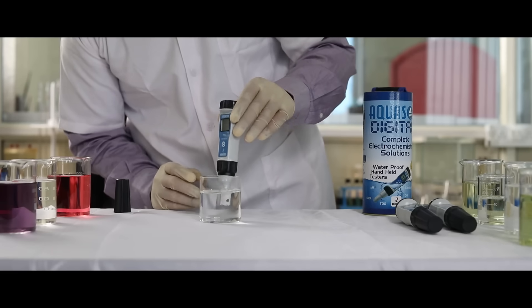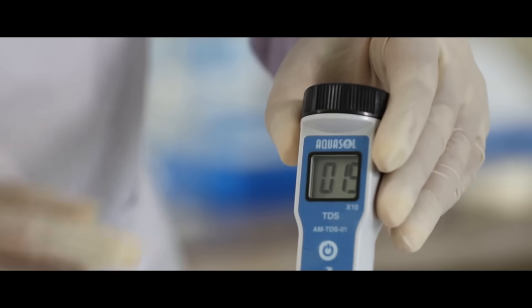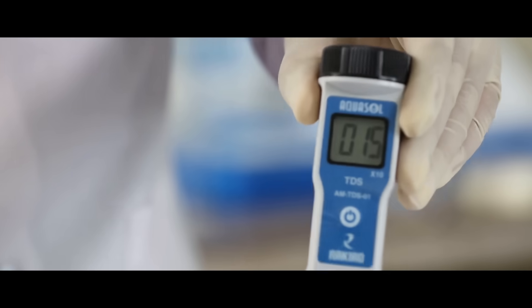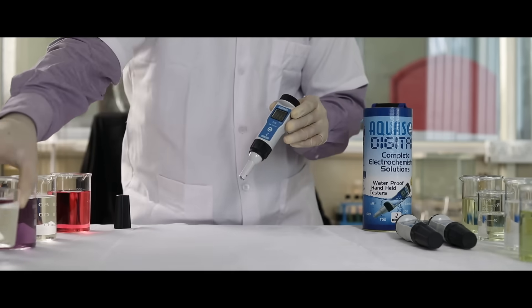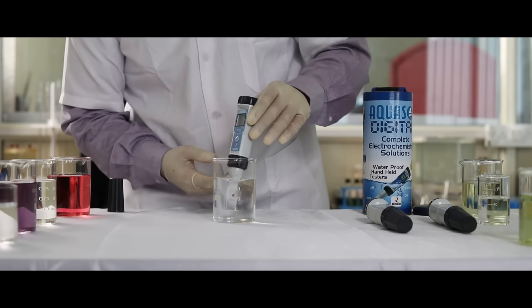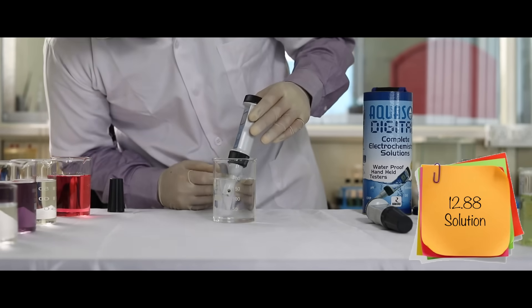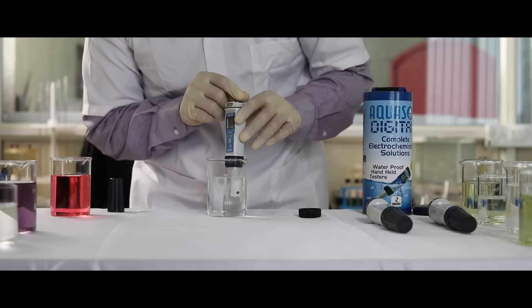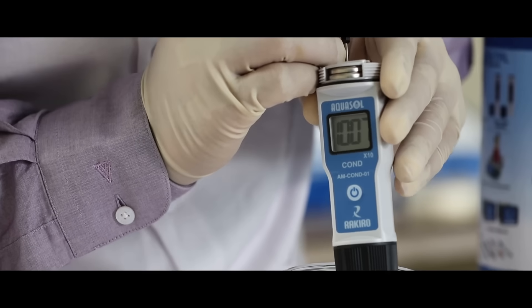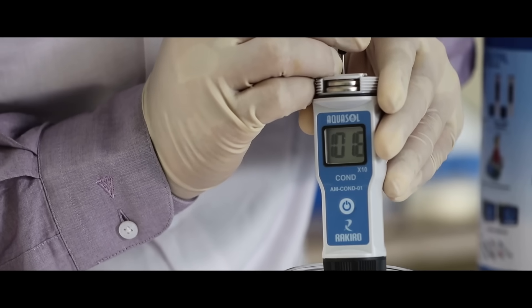Dip the electrode in the sample and stir gently for a stable reading. Use the span screw to adjust the reading. Once the meter is calibrated, wash the electrode. The meter is ready to test the conductivity of the sample.